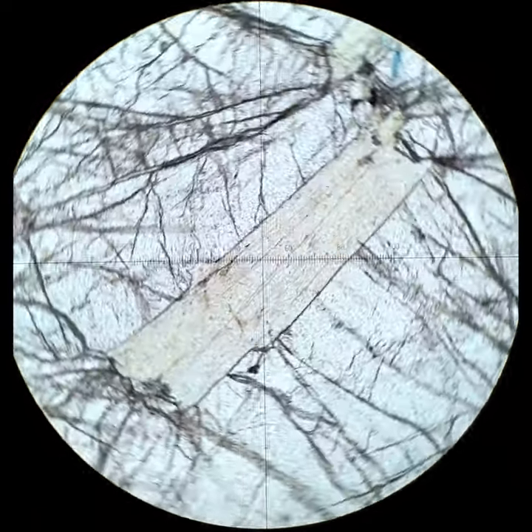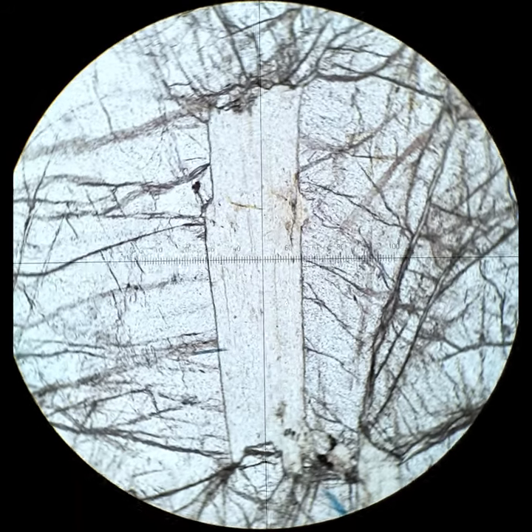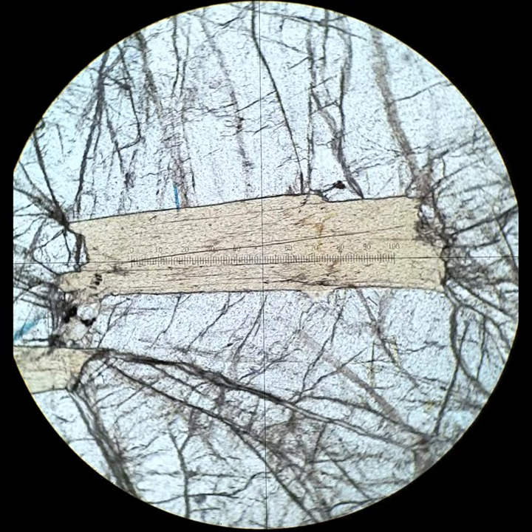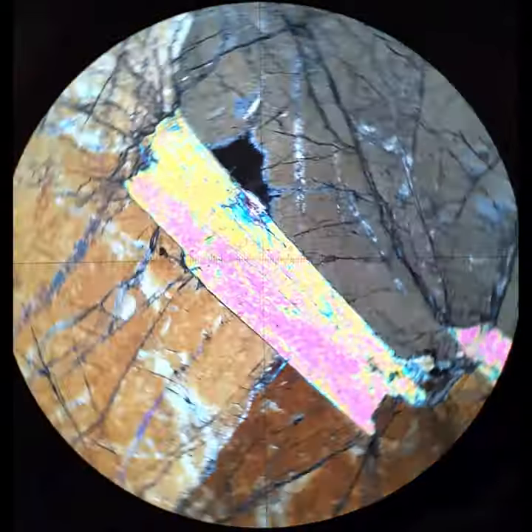Biotite, another mica, has one good cleavage. Those are the very thin lines that are approximately parallel to the long axis of this brown crystal. Across the polars, you'll see that the mineral goes extinct as black when those lines are approximately parallel to the crosshairs.